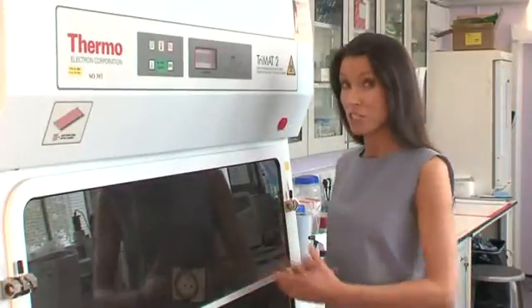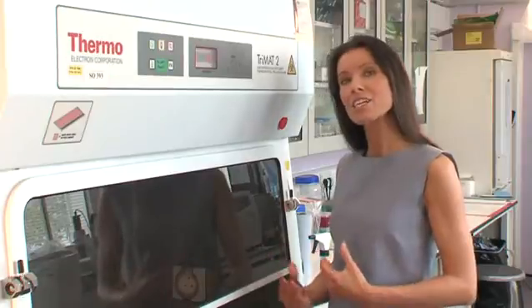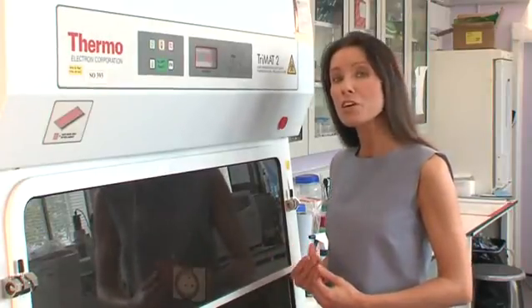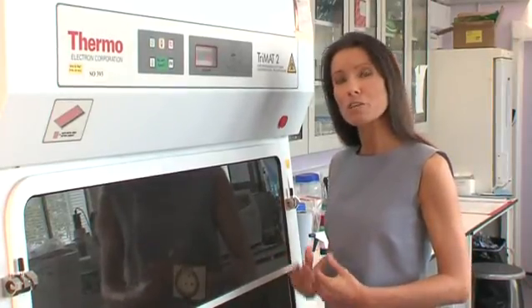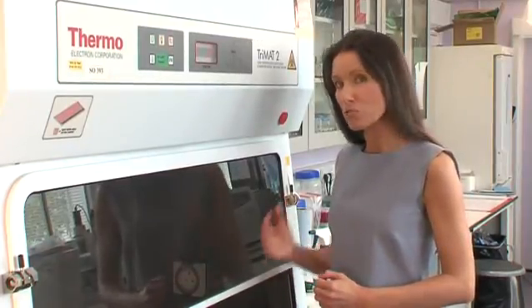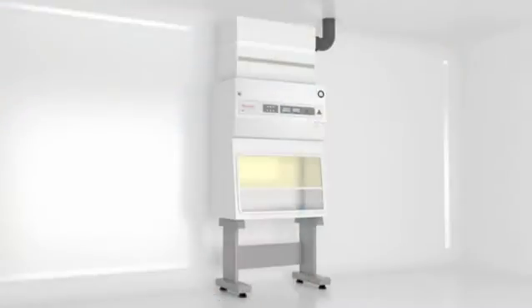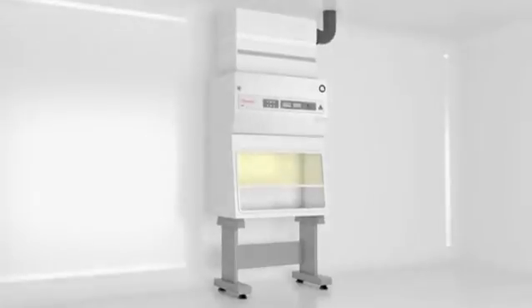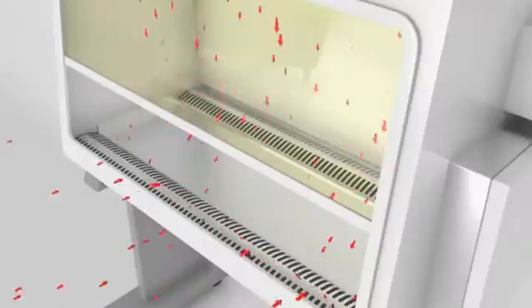The class 2 biological safety cabinet is designed not only to provide protection for personnel but also to protect work surface materials from contaminated room air. Class 2 cabinets differ from class 1 by allowing only air from a HEPA filtered sterile supply to flow over the work surface.